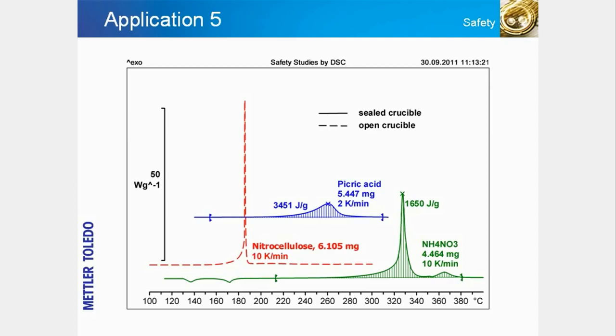Some of these products, for example picric acid, trinitrophenol, are starting materials for chemical syntheses or are used for analytical purposes. Others find use as propellants or explosives, for example nitrocellulose or ammonium nitrate. The latter as fertilizer has already been the cause of several very serious explosions.